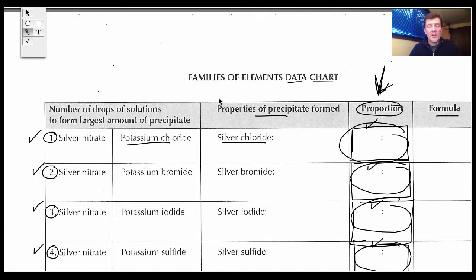Okay, you're coming back to this video. You should have already completed the experiment by combining your two chemicals in the necessary ratios and writing down your observations, and then making a conclusion about which ratio you think is the best, which gave you the best results.